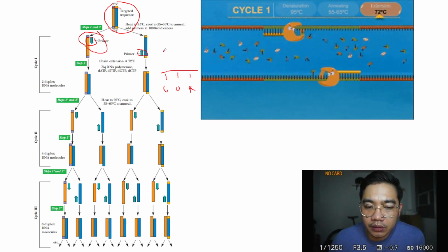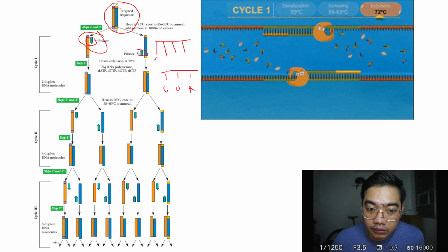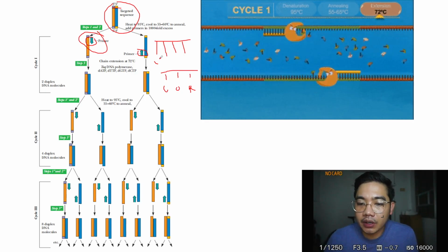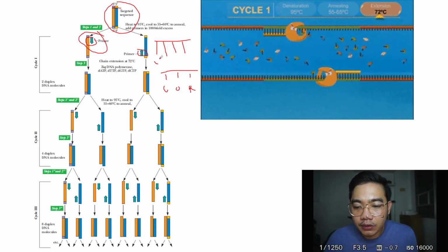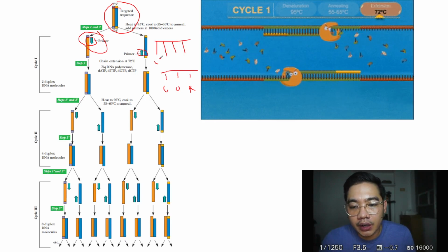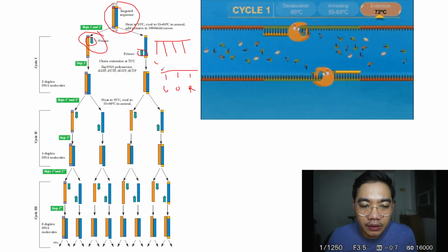the virus has. What specific DNA strand, and what strand is specific to that virus? That's why it took a long time before we could make PCR readily available to the entire world, because viral mapping of SARS-CoV-2 was still being done. So how can we detect something if we don't know what it is? After the viral and genetic mapping was done, the companies who make PCR then made their primers.